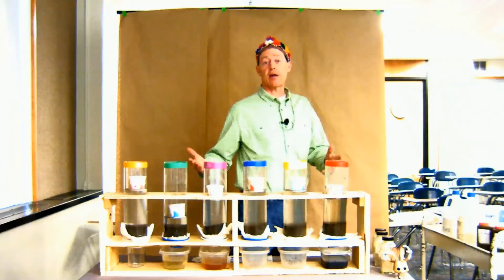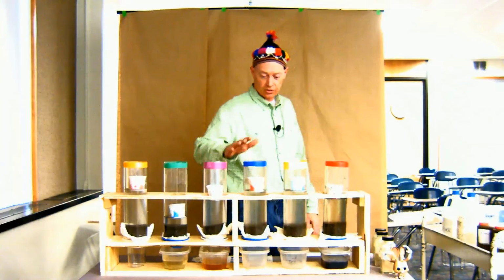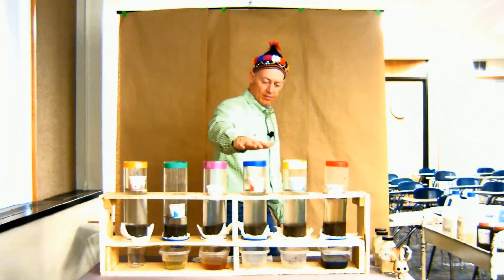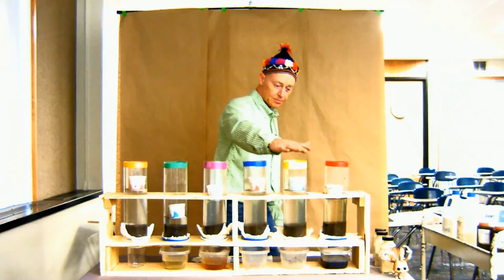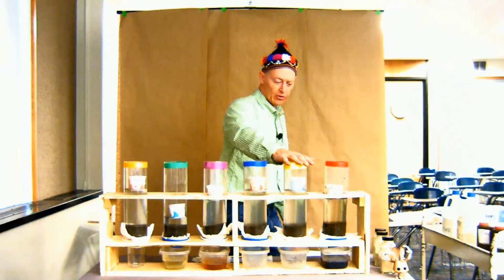Now, don't expect this to happen in your field at home. It takes a while for these reactions to occur, but we're sort of speeding it up by concentrating it. This is the pelletized gypsum. No water has moved through at all. This is the spent lime. No water has moved through at all.